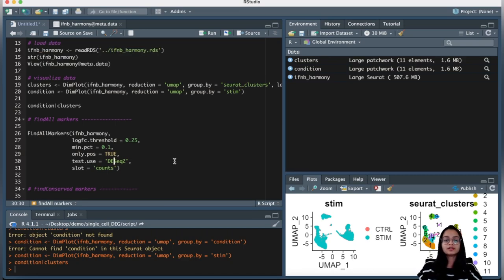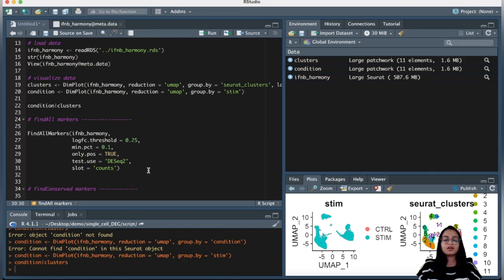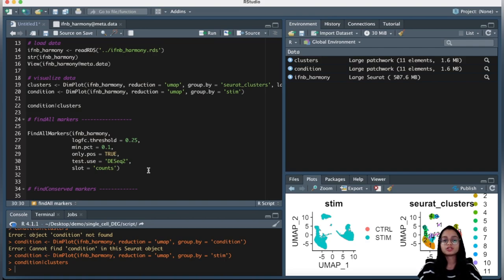Before moving to FindConservedMarkers, an important point: to find differentially expressed markers, the default assay must be RNA. Methods like canonical correlation analysis implemented in the Seurat package return a corrected expression matrix saved in a new assay called the integrated assay. That is not the case with Harmony, which returns corrected dimensionality reduction values stored in the same RNA assay — so no new assay is created. It is always advisable to check the default assay before proceeding. Since we used Harmony, our default assay will be RNA, but if you used another integration method, you may need to set it back to RNA using the appropriate command.